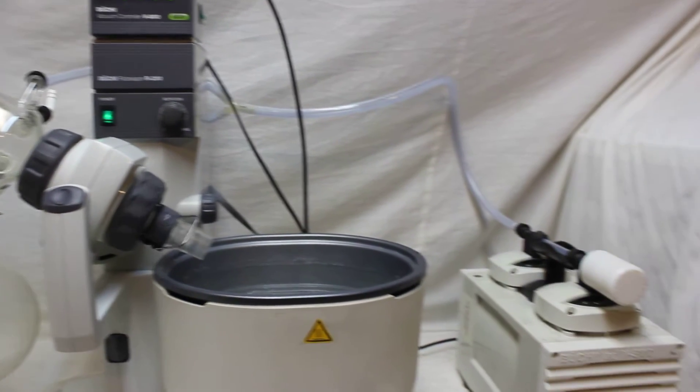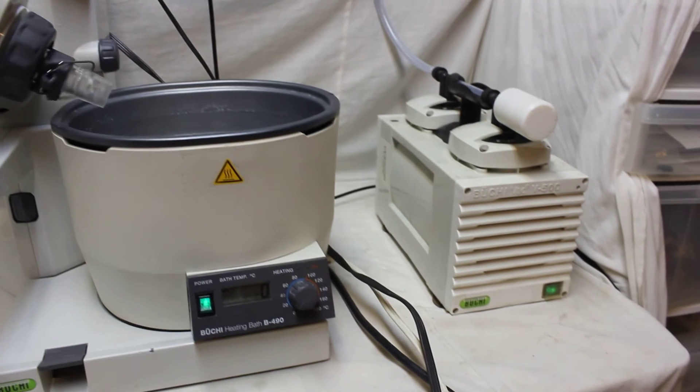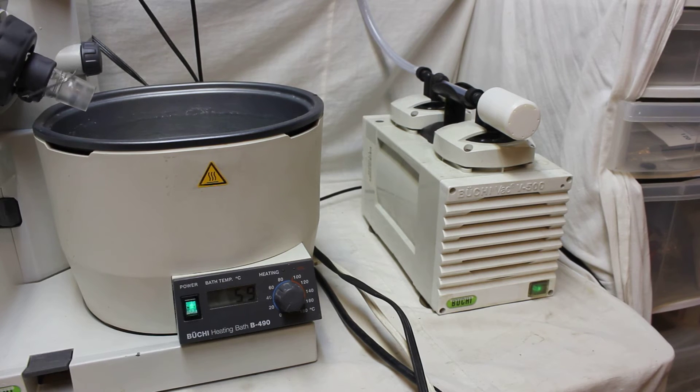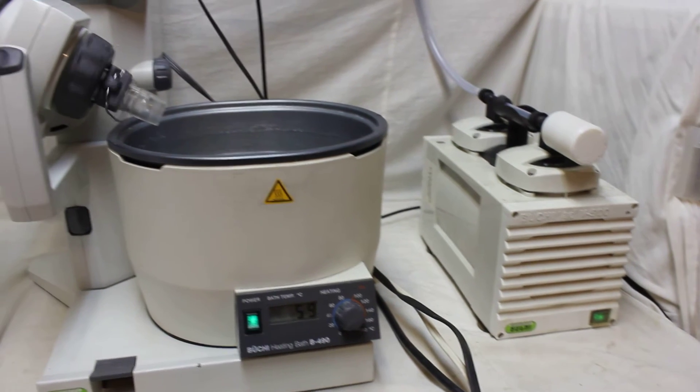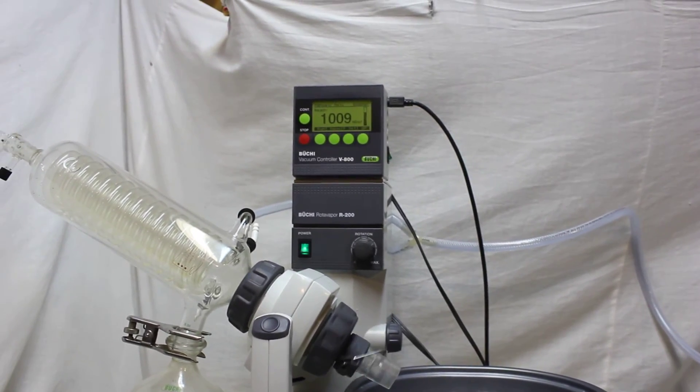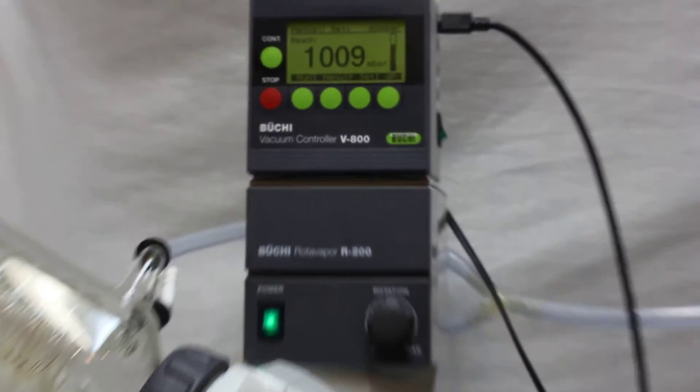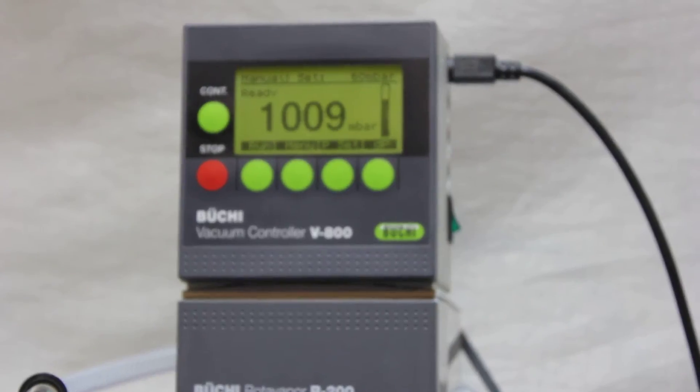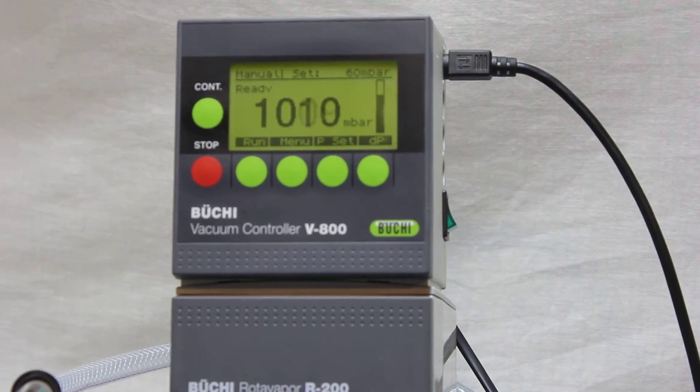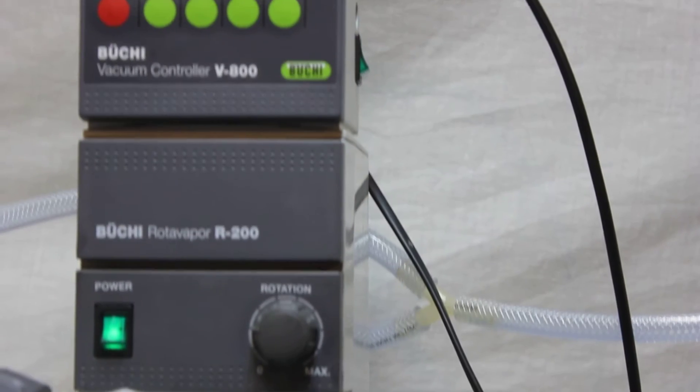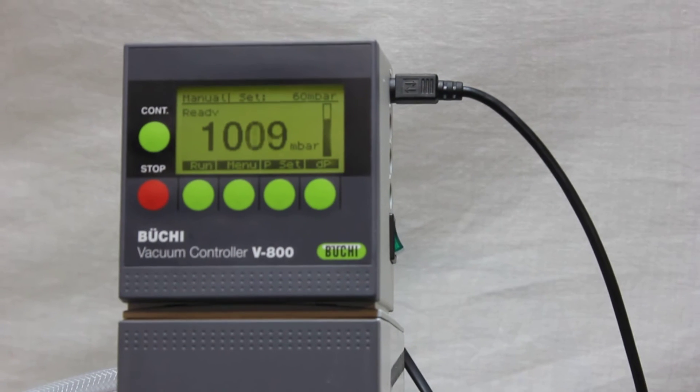Now the only thing left is attaching this equipment with the Buchi vacuum pump. V500 is already connected to vacuum controller V800 that you can see here. Let's see what happens when we turn it on.